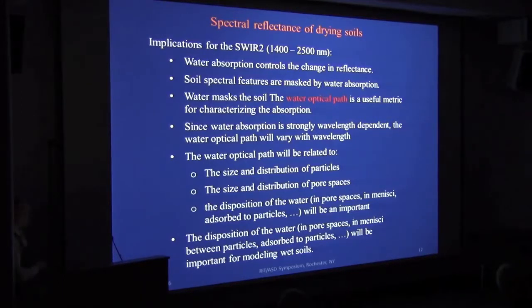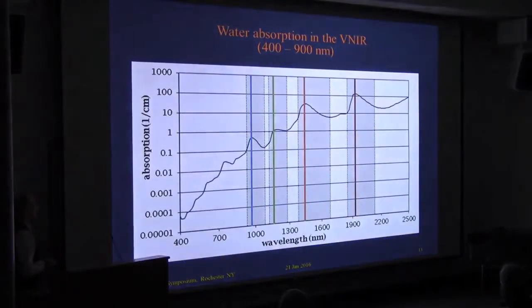Those are going to be controlling that, which also suggests that this should change with angle. We have a goniometer. We haven't made all the measurements at angles yet, but we expect significant changes in the spectral reflectance as we change the viewing angle, and as the water content changes. Okay, I've got to move a little more quickly here.